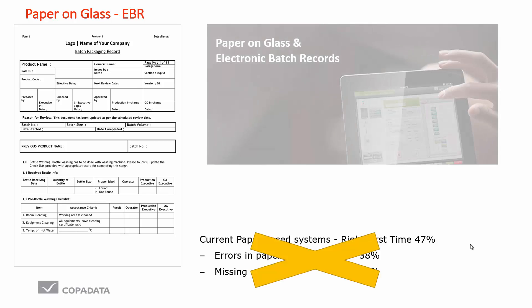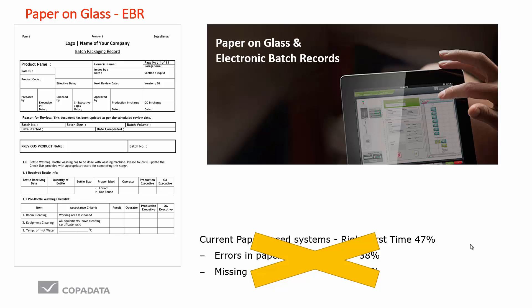What I'm proposing is to use a mobile tablet application, the paper on glass application, to drive the operator's instructions and record the information automatically in an electronic archive.